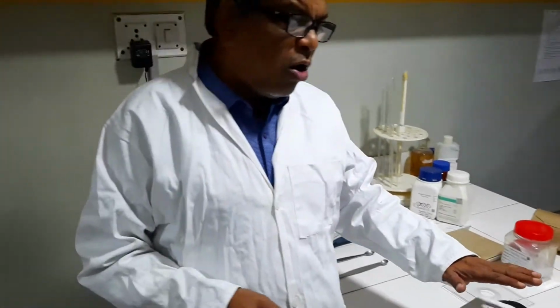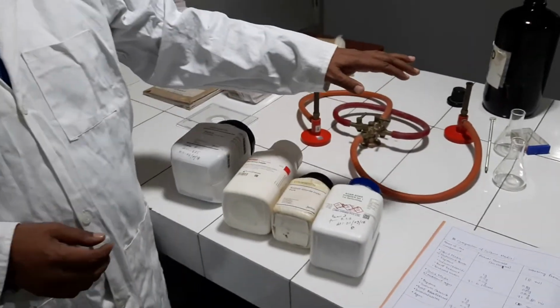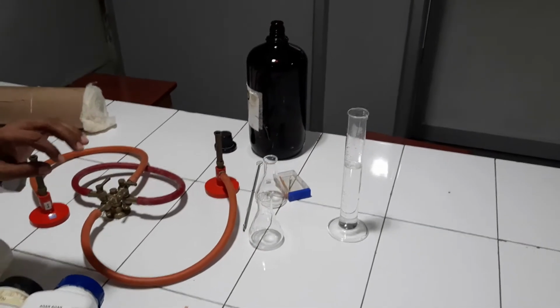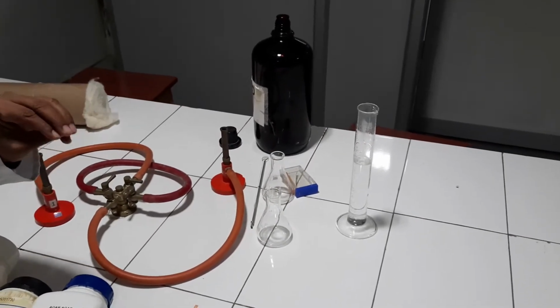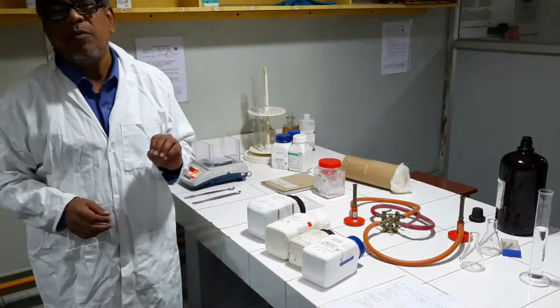So when we weigh all the three ingredients and put them in a conical flask, they will be moistened with a little bit of distilled water, that is called purified water IP.